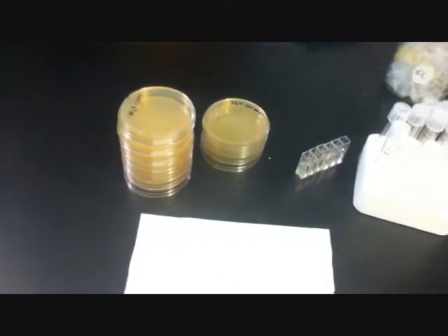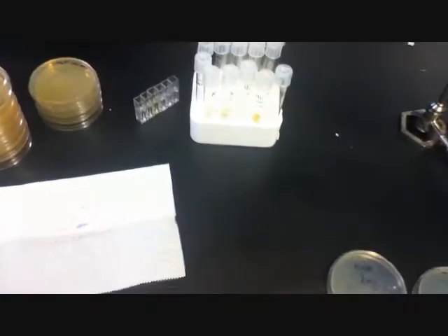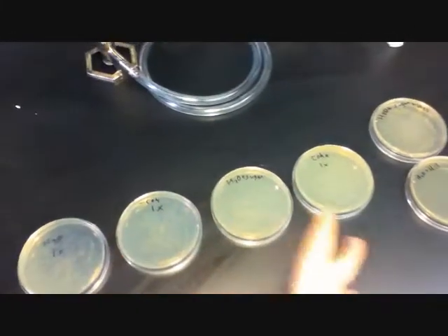But there were other plates as well. As you can see, these were some dilutions made to help compare and contrast where each plate would be qualitatively compared to each other.